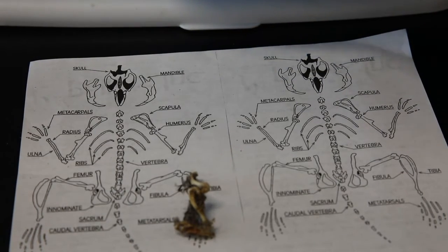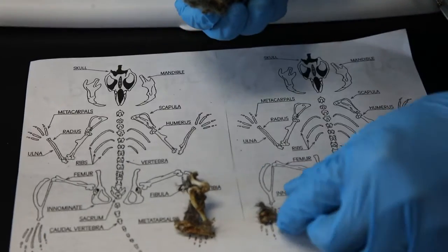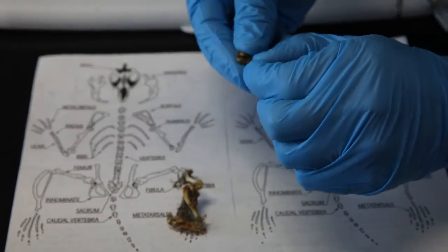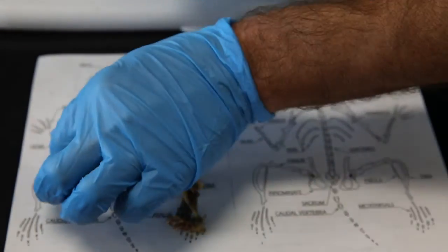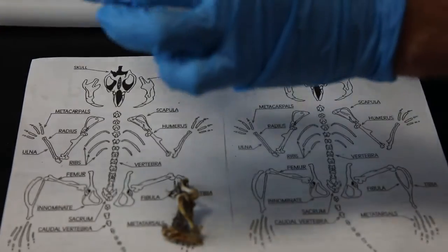Well, we don't have smell-o-vision here. It's not that good. What do you think that... Oh, this is more like a leg joint. I would say this bone broke. That could be here, too. Yeah. Either one. Could be. So take all the fur off of it.